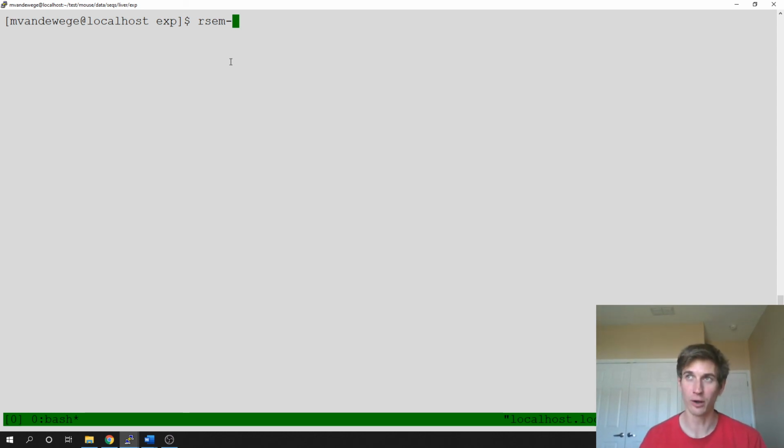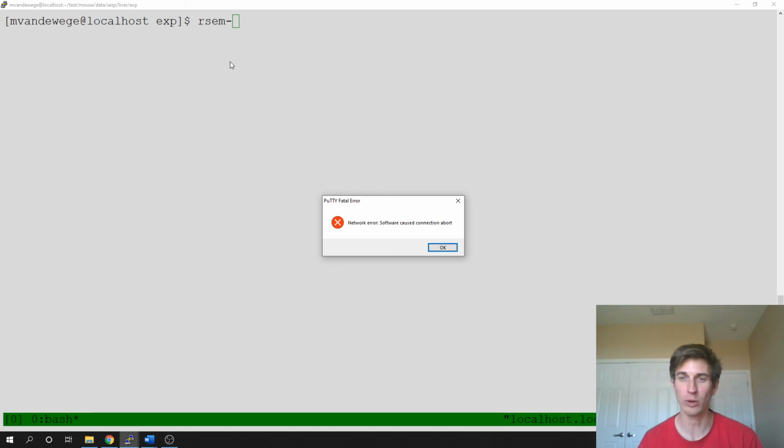Those files are manipulated in a way that makes searching much, much faster than doing a raw, brute force search to look through which reads came from which. Oh boy, I timed out.